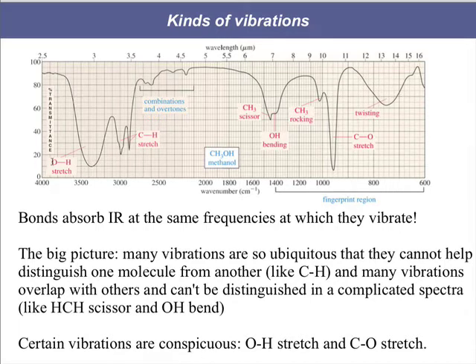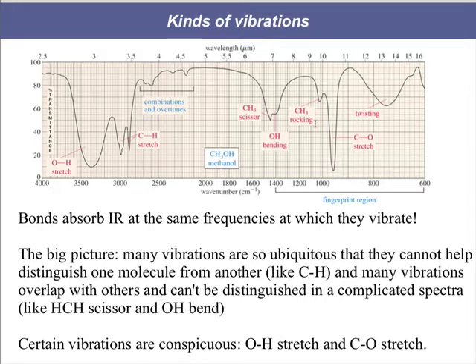That turns out to be an OH bond stretching. We've also got absorptions around 3,000, which is a CH stretch. And we've got some other bonds way down here, which involve a CO stretch and some of these other vibrational modes like a CH3 rocking and a CH3 scissoring and an OH bending. We've also got some other combinations going on around 2,500. We'll talk about those a little bit later. So we've got this graph, and again, it's plotted upside down. We're looking at the inverted peaks. Those low transmittance or high absorbance peaks are what we're going to pay attention to.